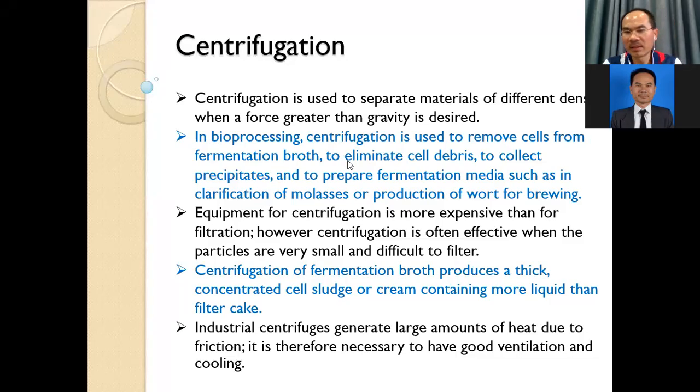In the previous topic we talked about filtration, and now we will consider centrifugation. Both centrifugation and filtration are the same operation: we would like to separate solid from a solid-liquid mixture. But the centrifuge is used to separate materials of different density. Aside from density, we use a force that's greater than gravity.